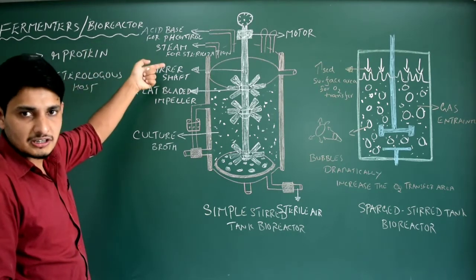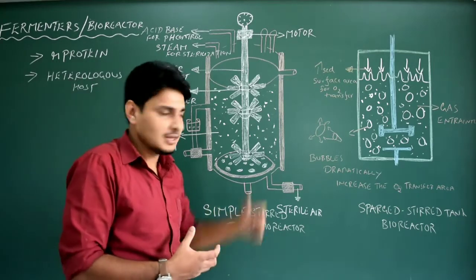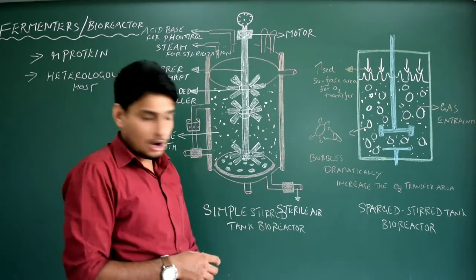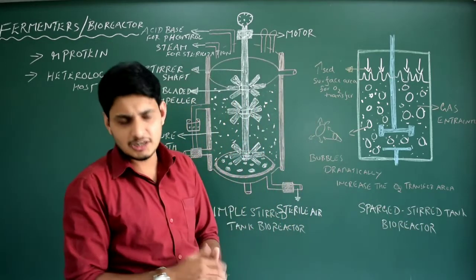Fermenters or bioreactors are one and the same actually. There are so many different designs available in bioreactors. Particularly, scientists prefer the simple stirred tank bioreactor, or sometimes the sparged stirred tank bioreactor. The reactors are required actually.